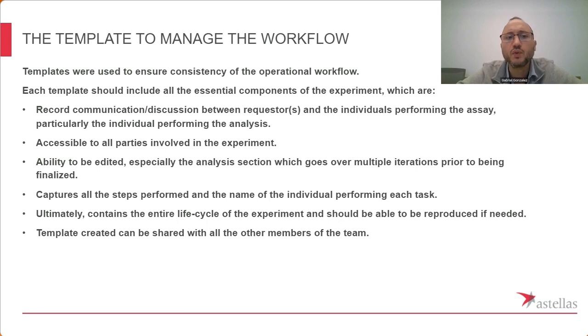Okay, so we wanted to record the communication between the requester and the individuals that are performing the assay. And this is of particular importance because when we are running and then analyzing a sequence run, we are a team, but the requesters might be from different teams. It might be even from teams that are outside of our institution. We have requesters from California. We have requesters from Japan.